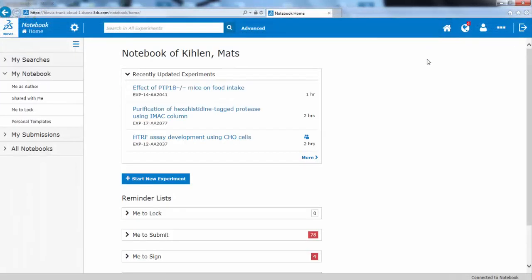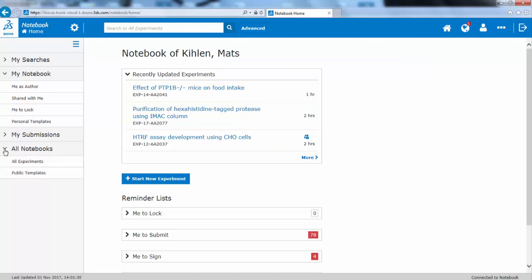In the web client, your colleagues' notebooks are available under All Notebooks, and here you have both All Experiments and the Public Templates.